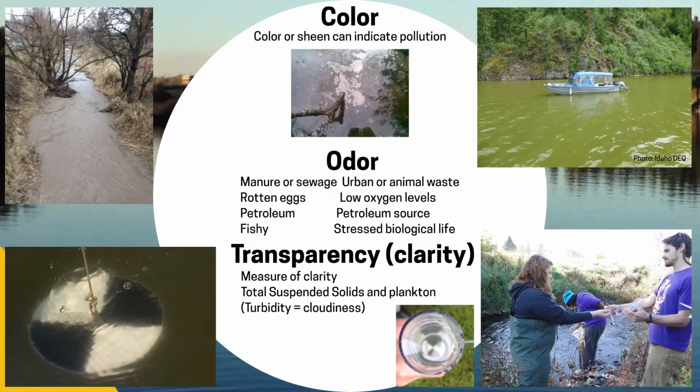Ponds, being still water, will allow sediment to drop out of suspension more quickly. Therefore, a Secchi disk measuring in meters is a better instrument to measure the clarity than a transparency tube. Streams carry a lot more sediment since they have the energy to move sediment around. A transparency tube measuring in centimeters is sufficient for this measurement.